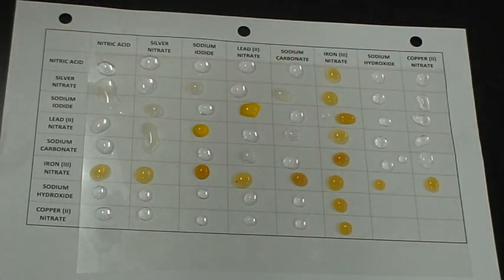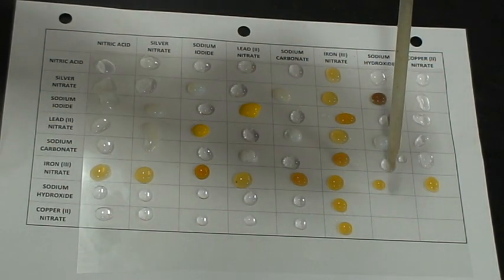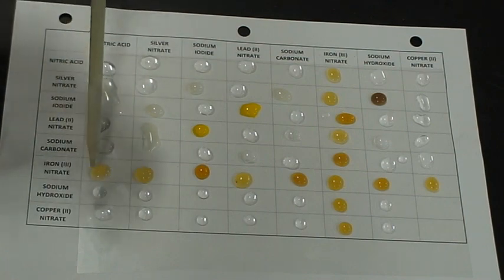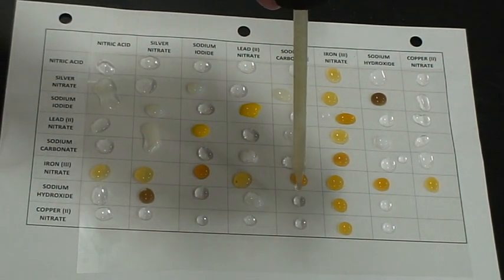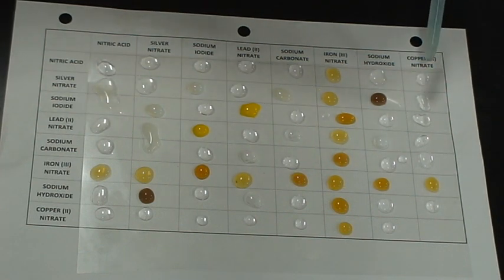It's very important to be qualitative with these, which means that we're going to be paying really close attention to those solutions. Different colors. Got to have a good eye for descriptions. It's not just yellow. It's like baby peeps yellow or something like that, mustard yellow, versus a softer color with it.